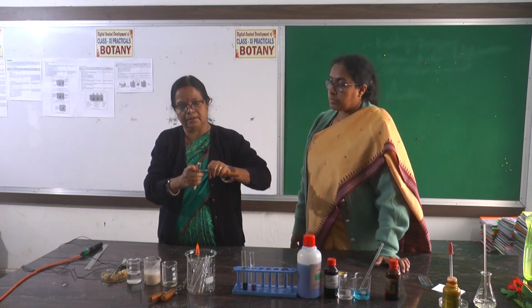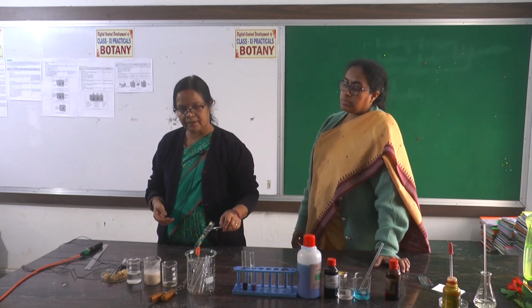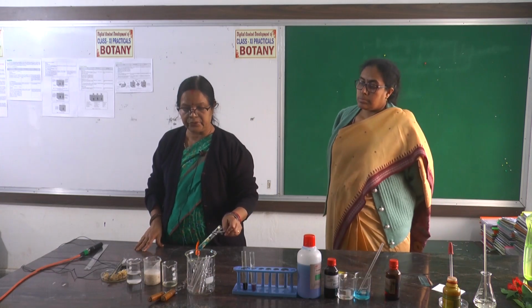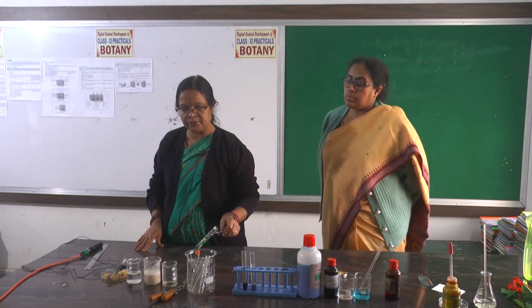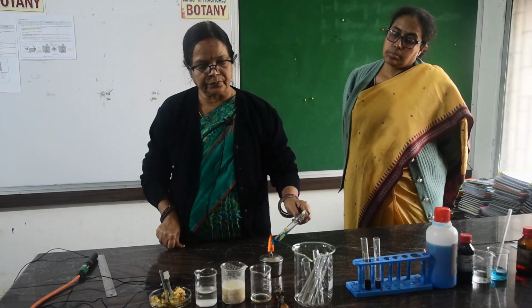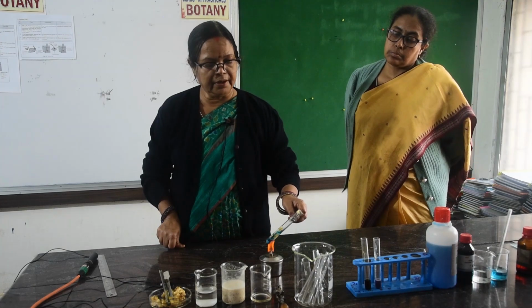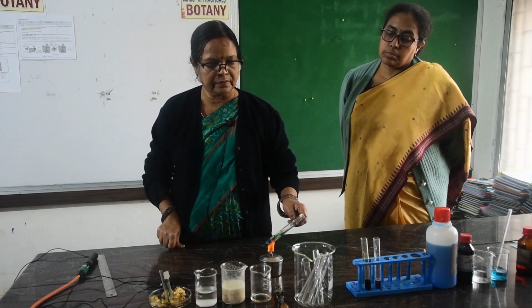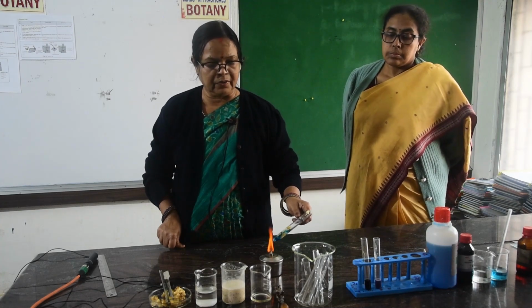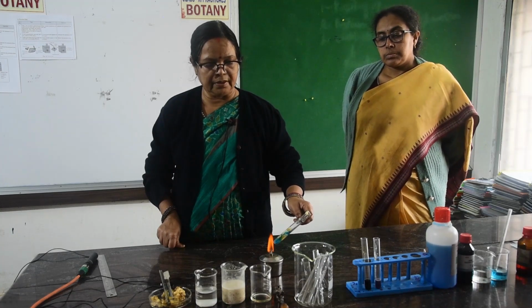Look here, it is blue in color, Benedict's solution. Now this Benedict's solution reacts with glucose. You know, ripe banana contains fructose. Glucose and fructose are reducing sugars, so gradually this blue color turns to green. Just wait, you have to heat it. Keep the test tube in a slanting position, away from your body, and don't keep it constantly in one place, keep moving it.